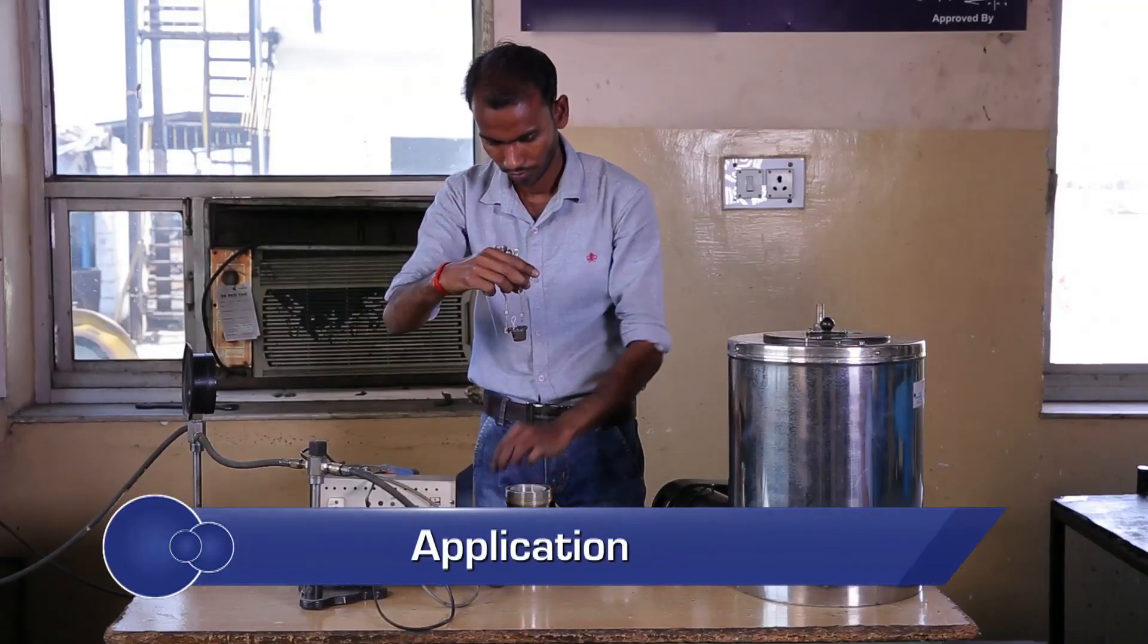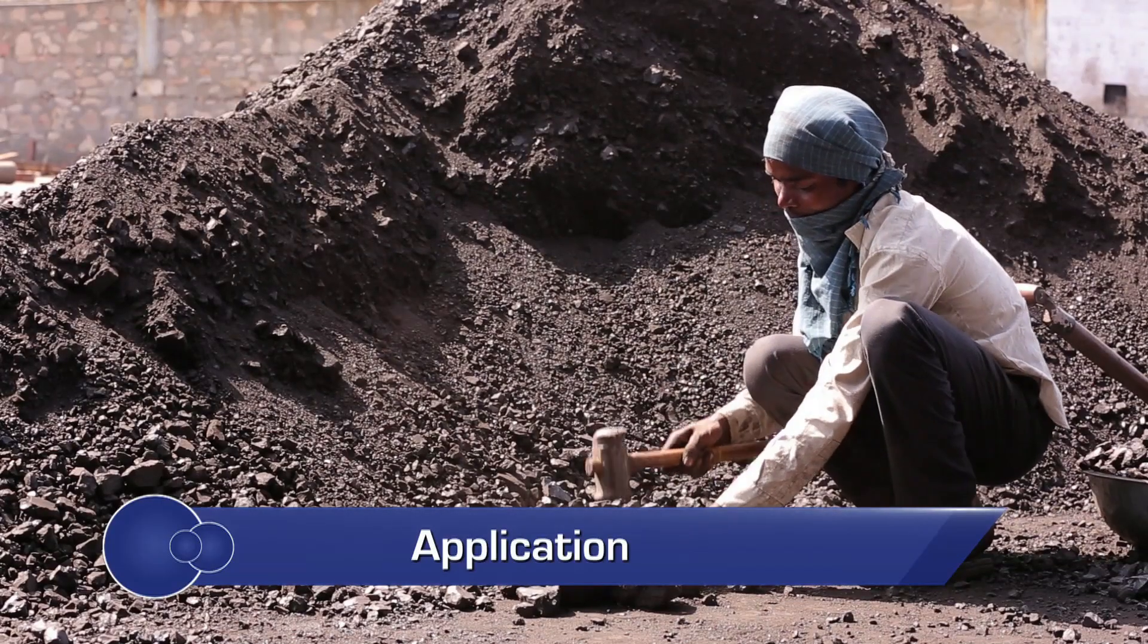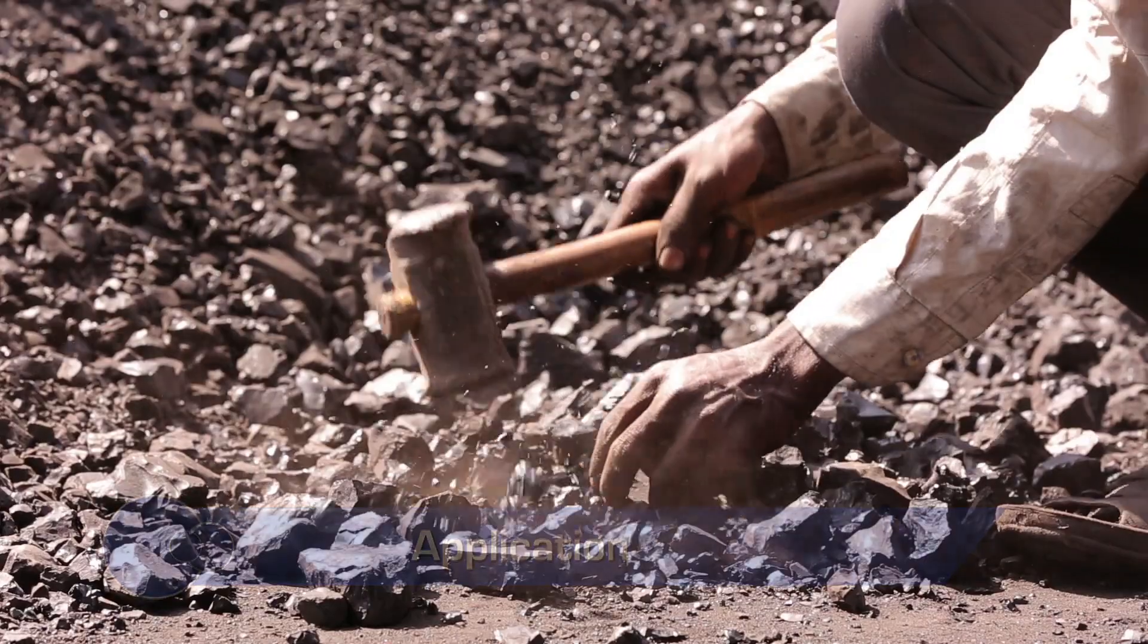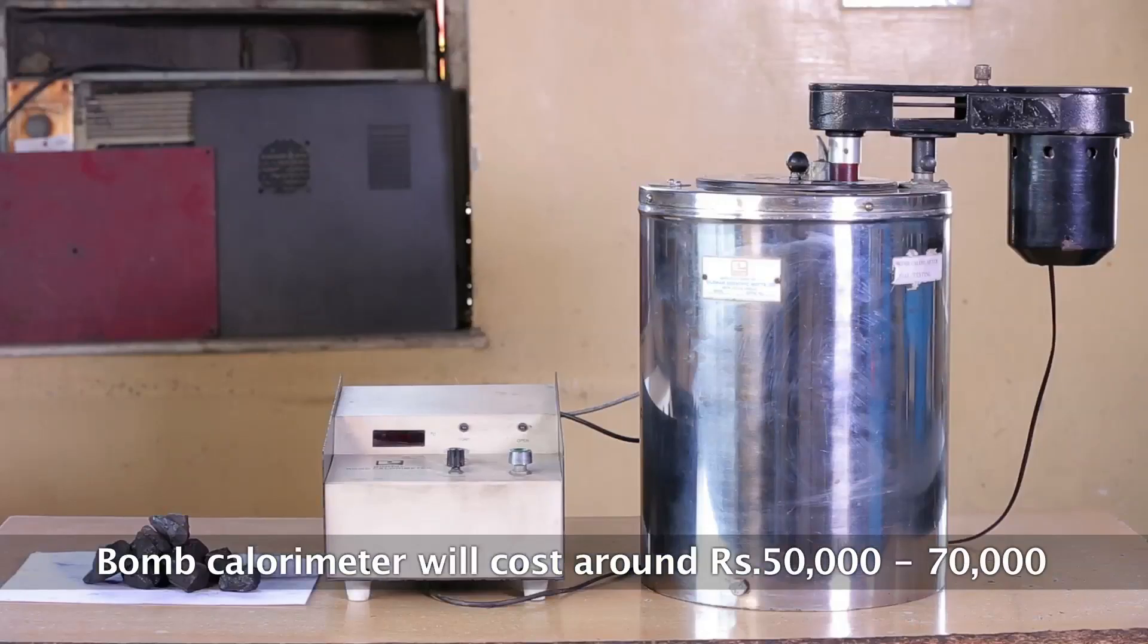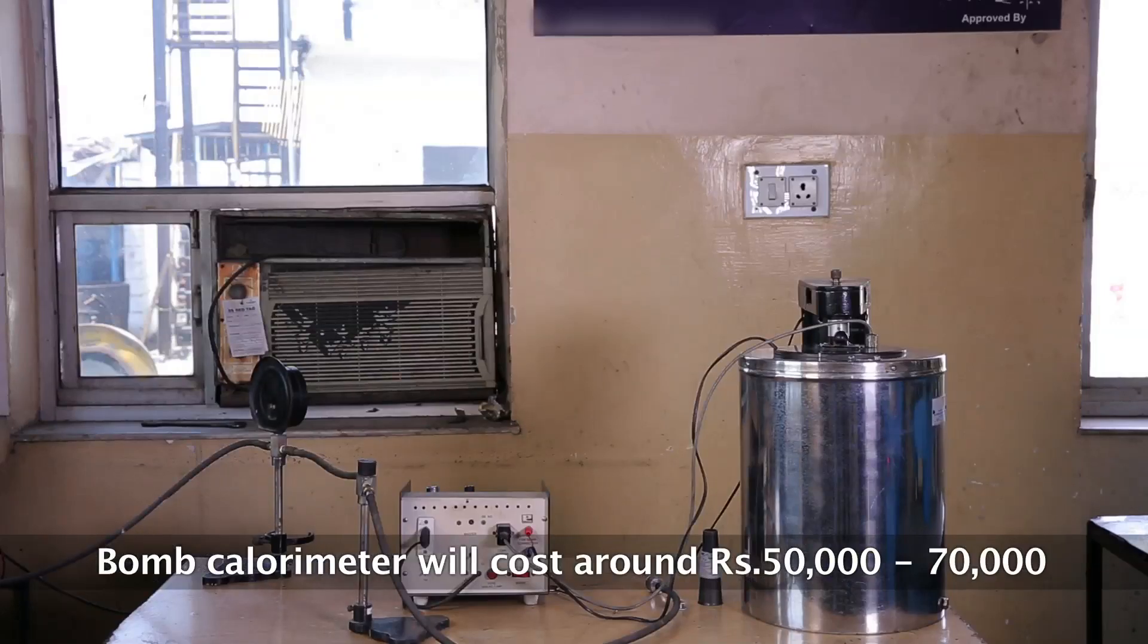A bomb calorimeter can be effectively used for determining GCV for any solid or liquid fuel. Normally, bomb calorimeter of this size would cost around 50 to 70,000 rupees.